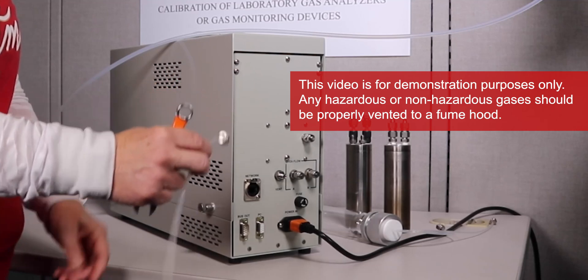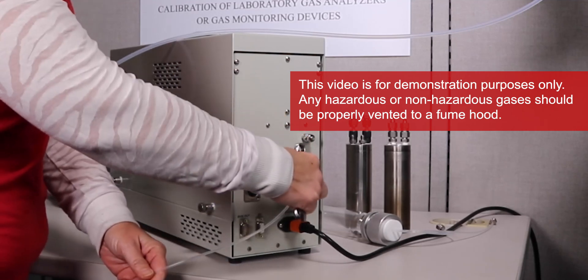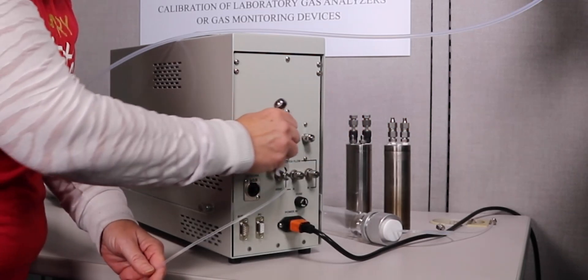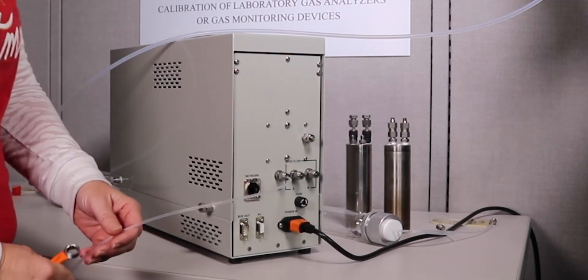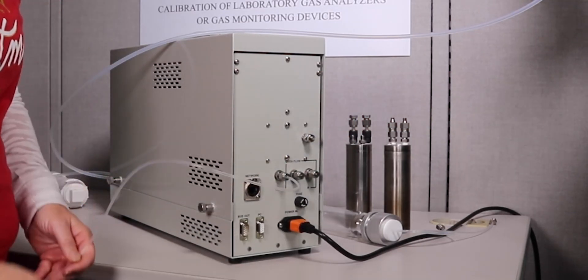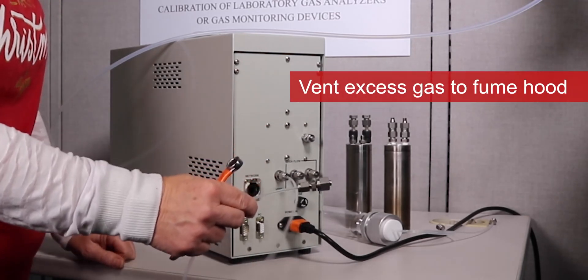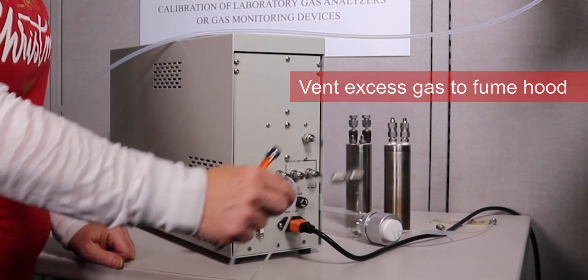We're going to take some Teflon eighth inch tubing and connect that to our vent port so that as we're operating the FlexStream base module and creating our calibration gas, when we go to the standby mode we'll actually vent any excess flow to a nearby fume hood.